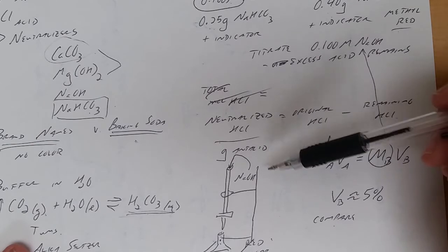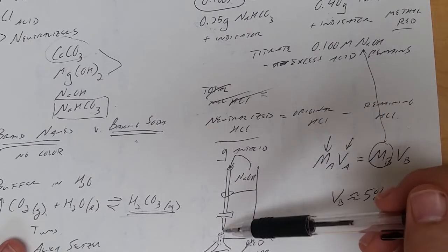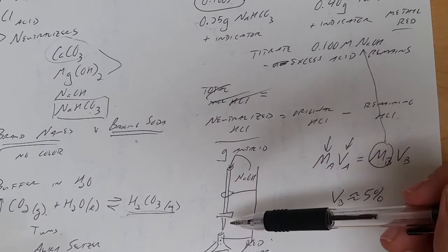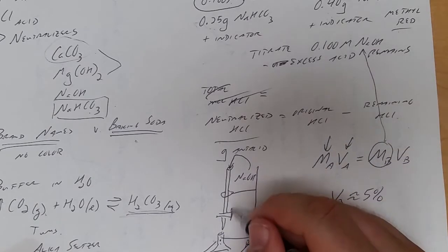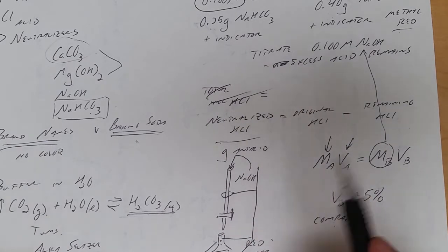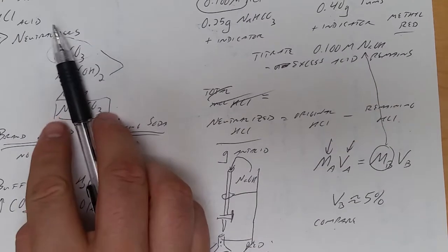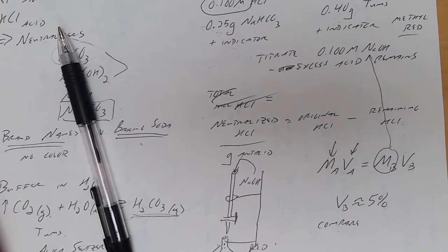Not all burettes are created equal, and so some of the tips deposit liquid at a greater rate. Some of the stopcocks right here are also difficult to work, and so getting this exactly perfect requires a little bit of skill and may not actually be within the realm of possibility without a lot of extra effort.